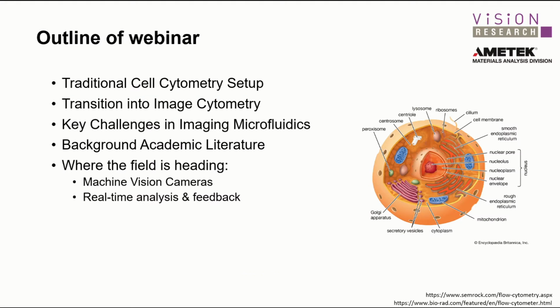So today I want to talk about, again, image cytometry and a little bit of background on the webinar. I'm going to just talk about traditional cell cytometry and how it contrasts with image cytometry and what are some of the benefits and drawbacks and so on.